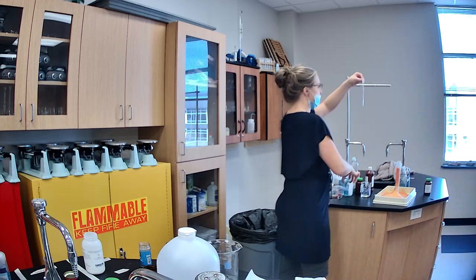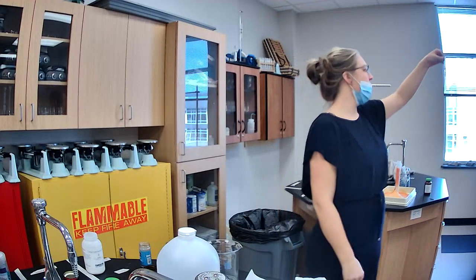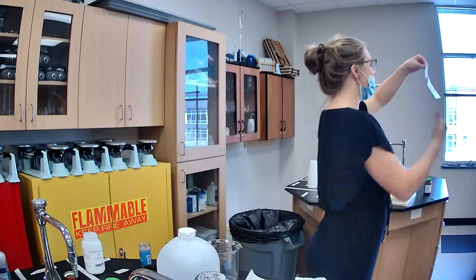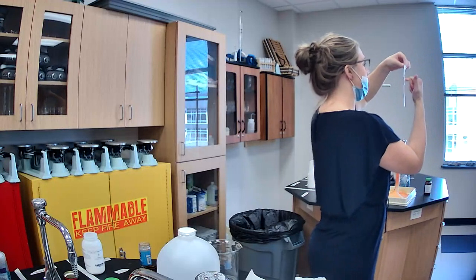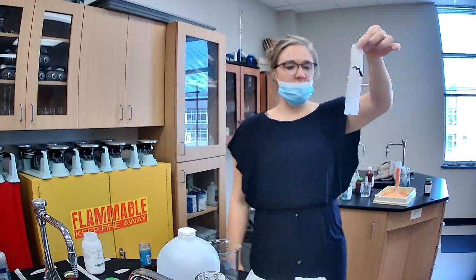And look how it turned out. See how all the ink moved up? You can see some red, you can see some pink, there's a little blue over here. But all the ink traveled up.